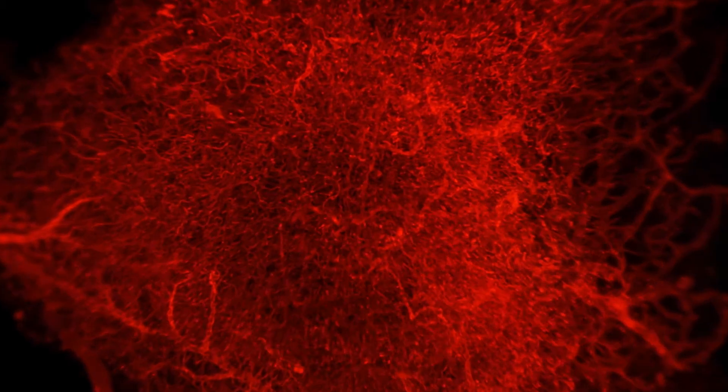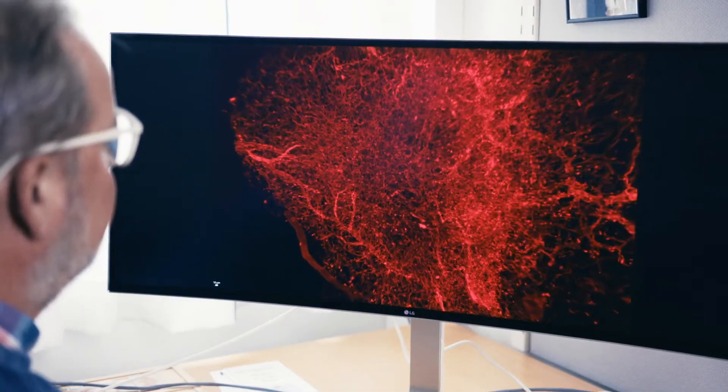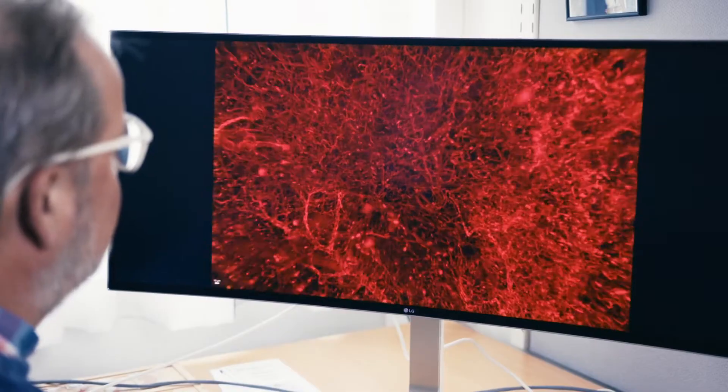Here we see in red the fine and delicate network of blood vessels. This is a normal breast from a young woman. It is very well structured and there is an order here between the smaller and larger blood vessels.